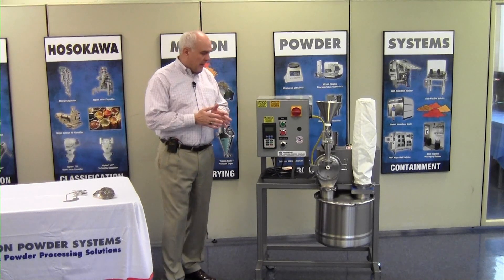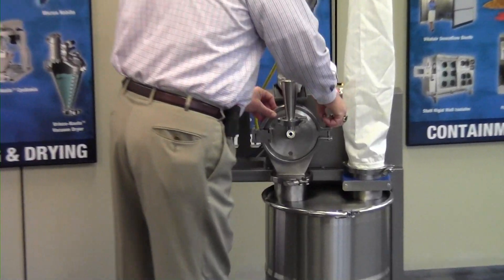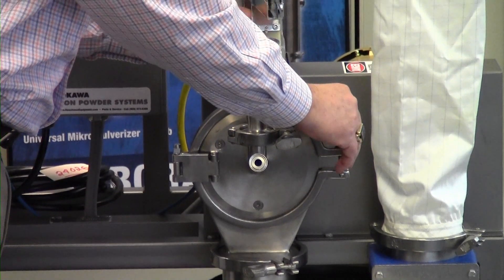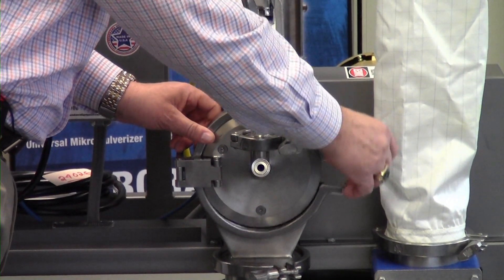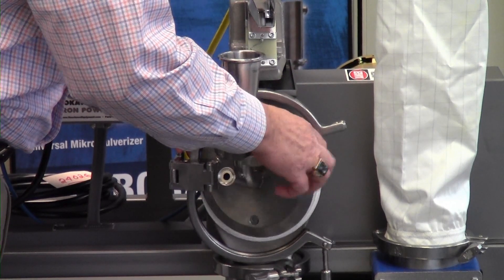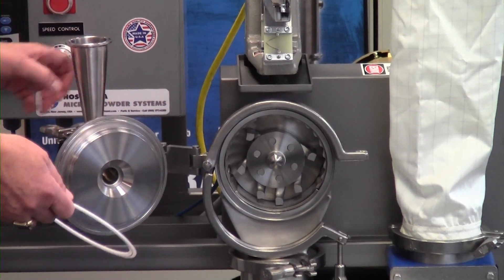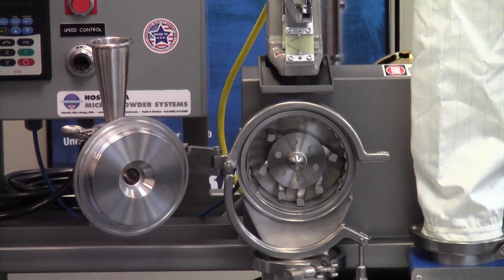Let me open the mill now and show you a little bit more in detail. You can see here that the mill is supplied with a tri-clamp connection, which makes it very easy to open. The door itself is on an articulated hinge, which holds it in place and makes it easy to locate.